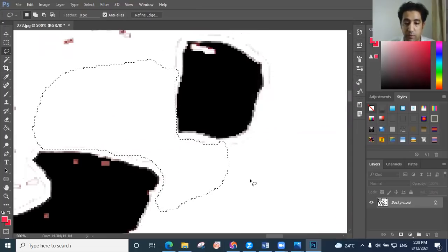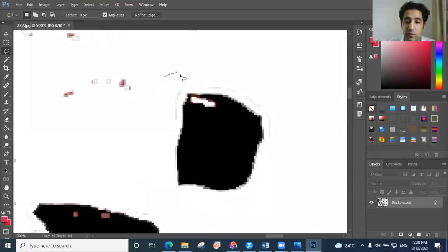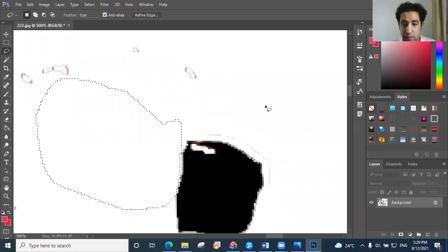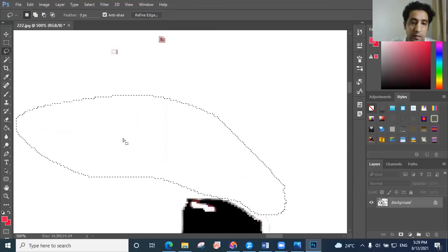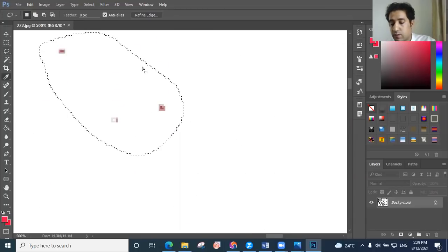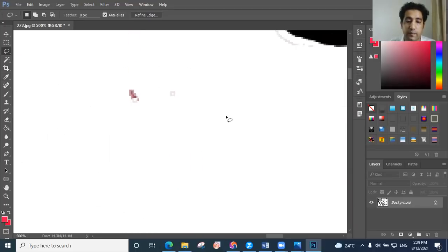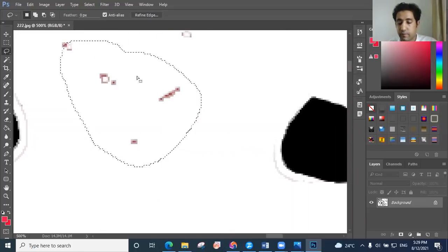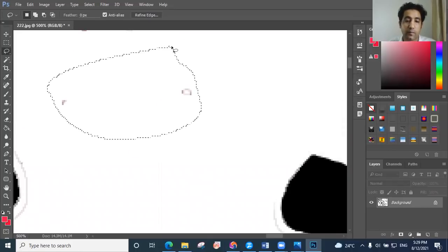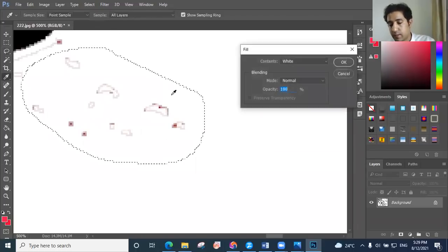Otherwise, you will repeat and do experiments again and again. And you say, what happened to my experiments? So you need to do things correctly. Otherwise, you will waste time doing experiments again. Determine and delete.